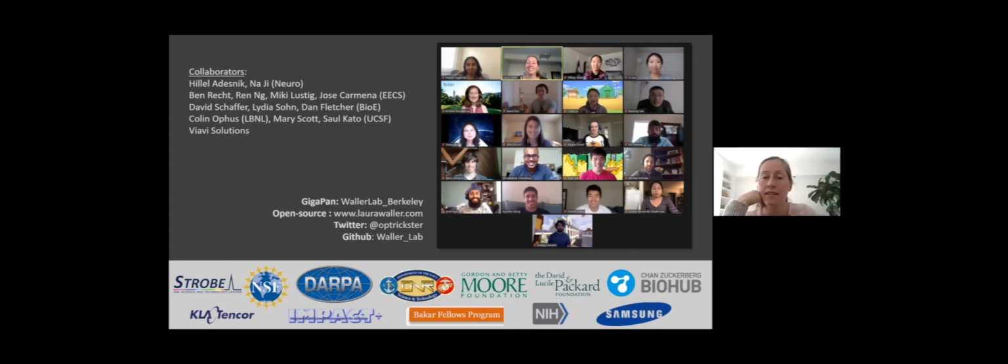Yeah, we haven't done any very careful analysis of this. I think it's really exciting, some of the uncertainty quantification techniques that could be brought in here. We haven't done any of this. Adversarial attacks, it depends, right? I always talk about phase imaging, because it's a nonlinear, non-convex problem, often the data you put in matters more than the algorithm you use as far as whether it works or how well it works. And so I suppose you could probably construct situations where you could have an adversarial attack, but I suspect that an embryo with all of its complicated things going on would be quite difficult to do. I'm sure that there are multiple solutions and we're sometimes getting local minima that are giving us wrong solutions sometimes. But we haven't done a proper analysis because it's so difficult, because it's a nonlinear system.